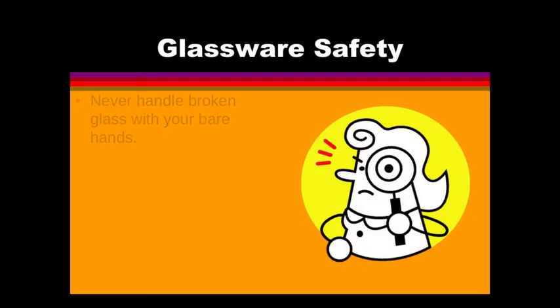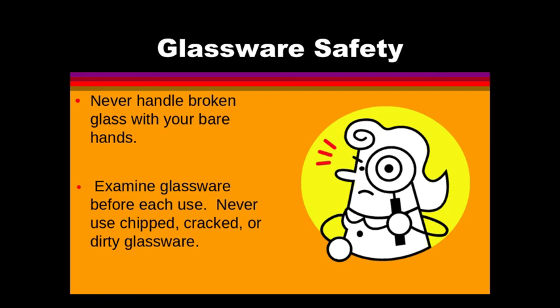Never handle broken glassware with your bare hands. I'm going to investigate and examine all the materials I give you, but sometimes I might miss something. So I'm going to ask that every time you get a tray of your materials, you look and make sure nothing's chipped or cracked or dirty before you start.